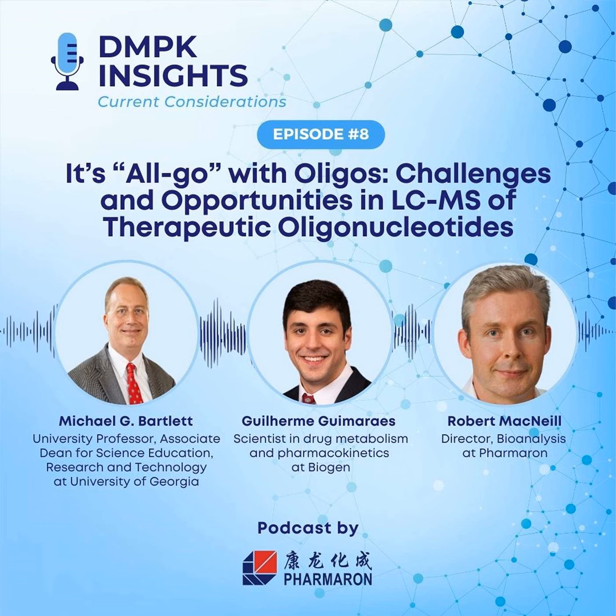And in addition to that, with greener lab initiatives, we know that some of these ion pairs are toxic. There are pushes to ban some of these fluorinated reagents in Europe. So it would be interesting to see how it plays out. But I think we could expect tougher regulations on these ion pair mobile phases, and with that, even higher costs. So that's another bigger thing, that some of these HILIC methods may be advantageous in that regard as well.